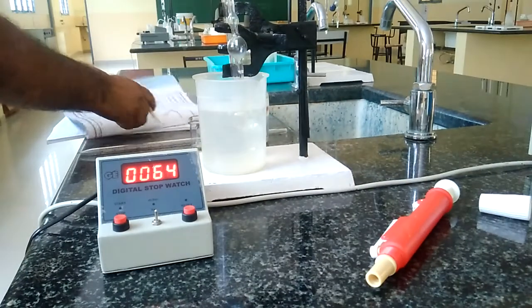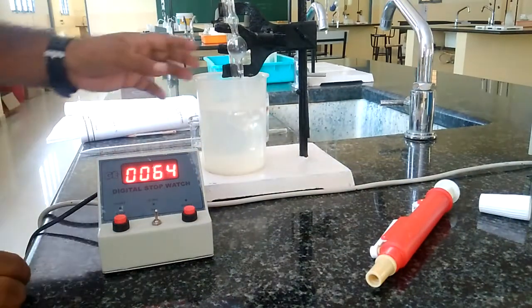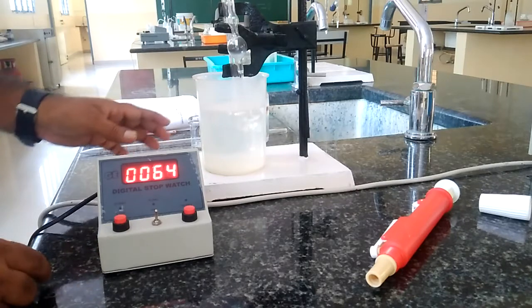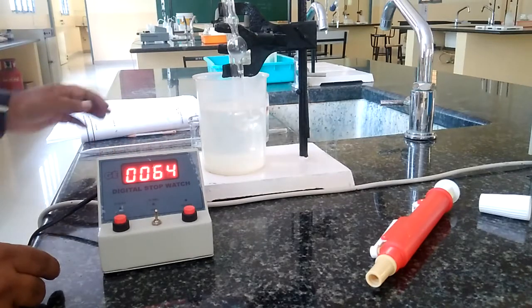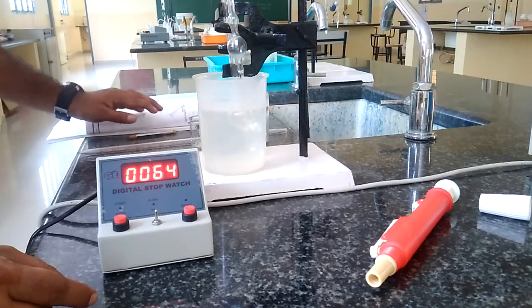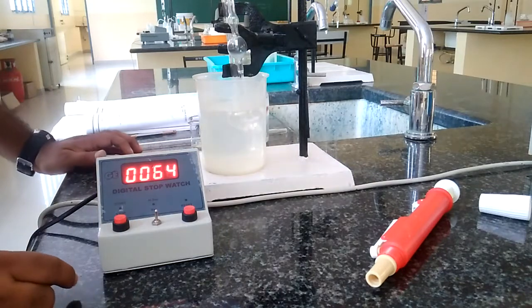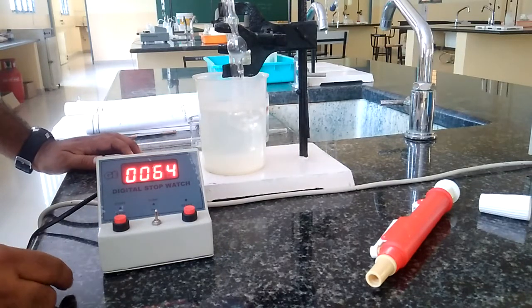We have to repeat two times again, second trial and third trial, in order to get the average. To nullify the percentage of error, we have to take the average of the three readings.